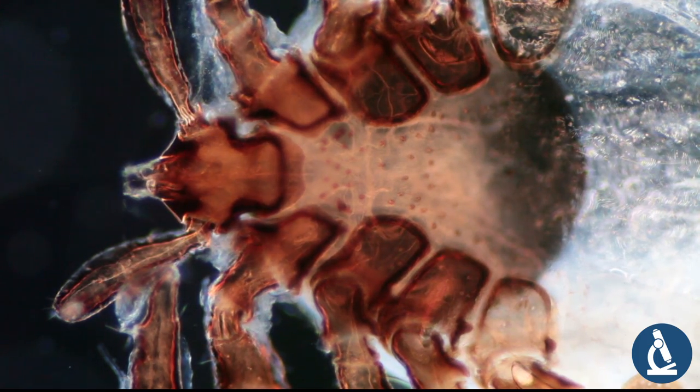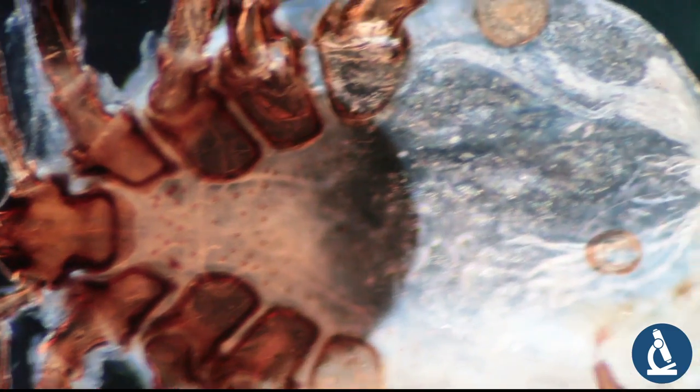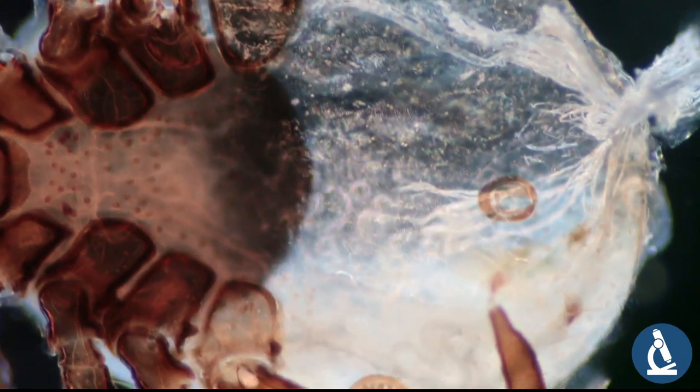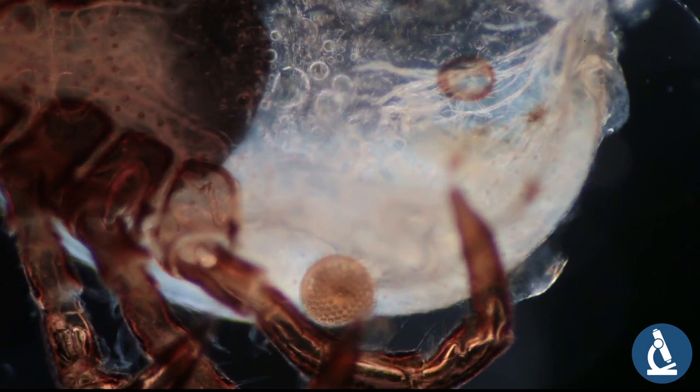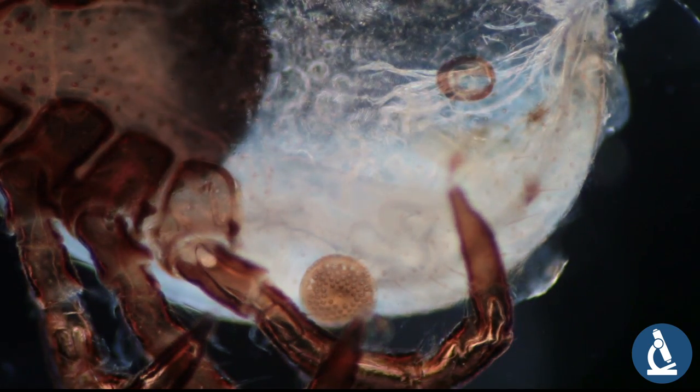What we can also see is that the tick does look a little bit damaged because there is something coming out at the back of the abdomen. I don't quite know what it is, but maybe during the extraction process it got damaged a little bit.